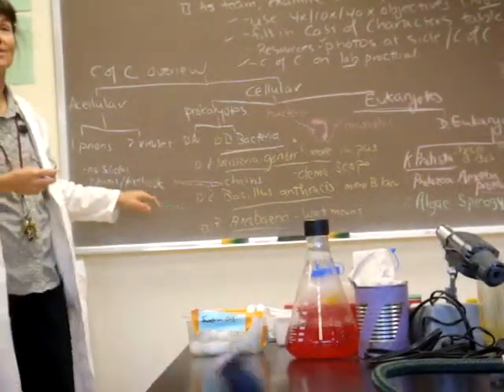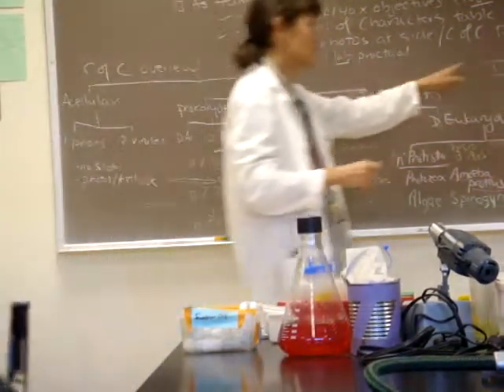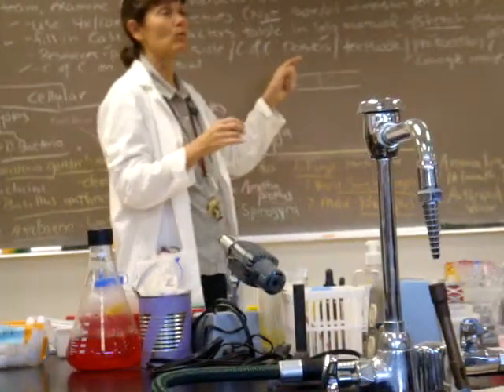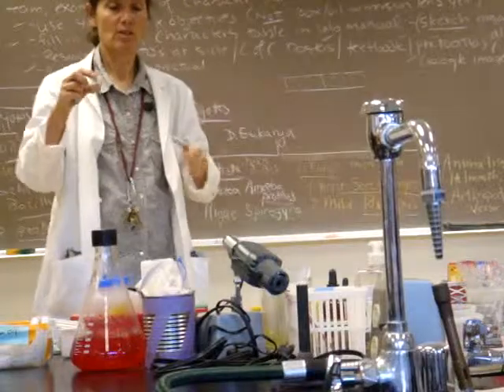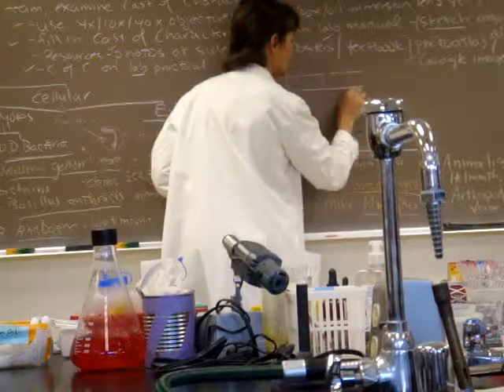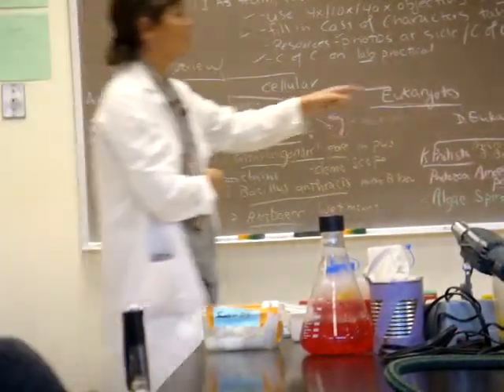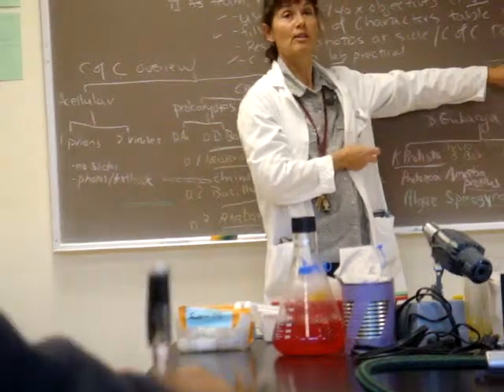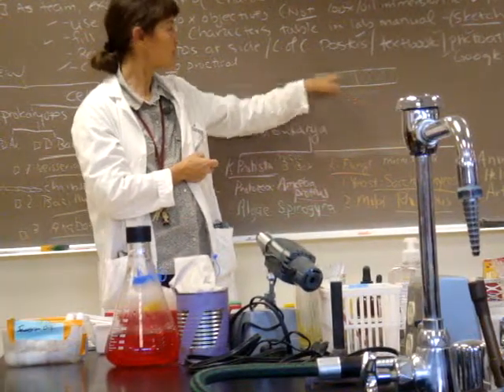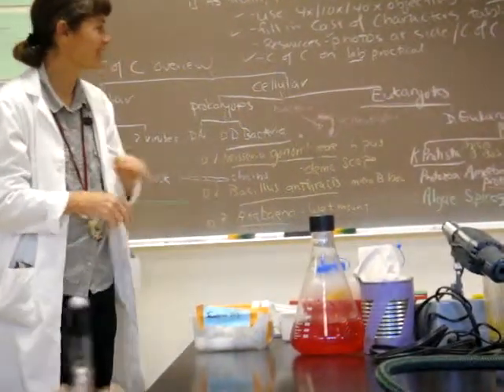So it was so cool to see that the size of the Anabaena cyanobacteria looked really similar to the size of those spiral chloroplasts. It was really fun. In one wet mount, the folks had both Spirogyra and the Anabaena, and it was just so cool. It was so cool seeing the difference in size between the eukaryotic algae and the prokaryotic cyanobacterium, and then seeing how that little cyanobacteria was just the right size for that spiral chloroplast. It was really fun.